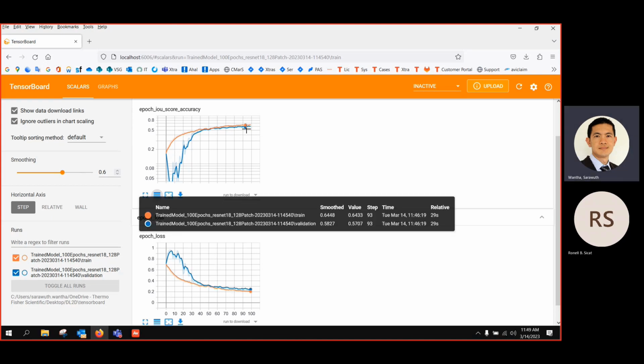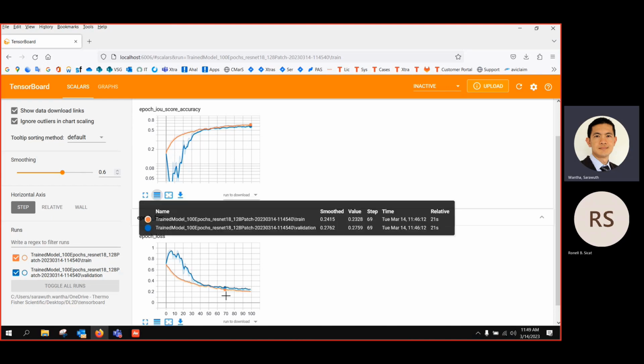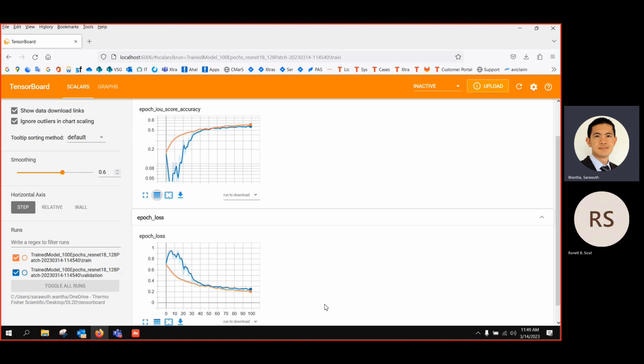And what we can see here is that we have a training accuracy of about 0.6. That's not so good, but it's just for a lovely image to get the first glimpse of what we could do, but at least it's converged at a certain point. And we have a loss of about 0.2, so we expect less, we want it down almost to 0 to have a good loss. So good training would be high accuracy and very low or 0 loss as the loss function.